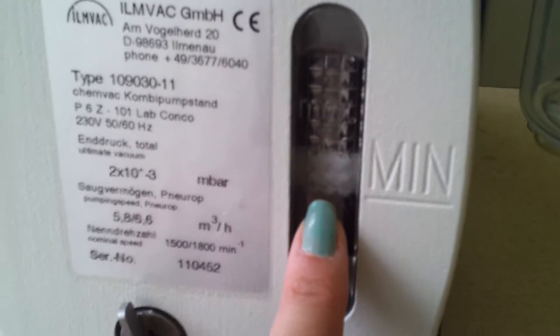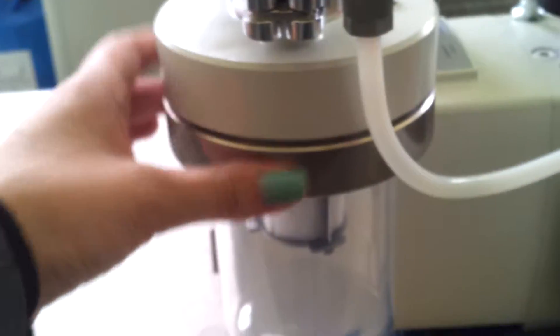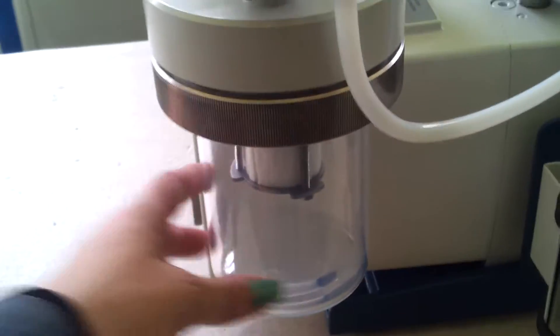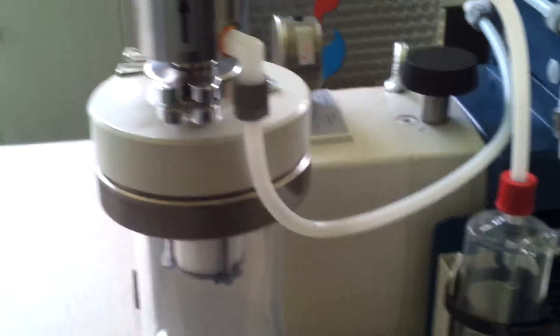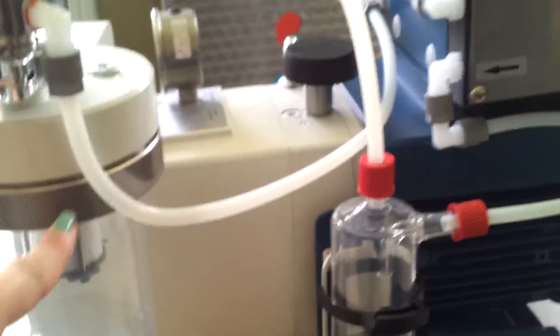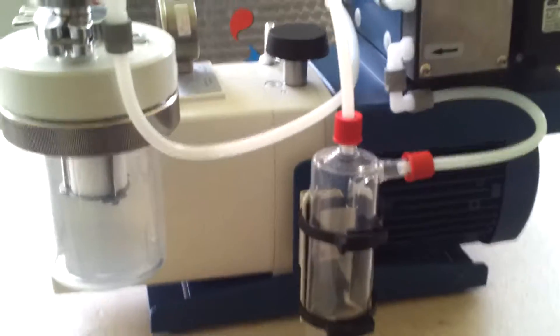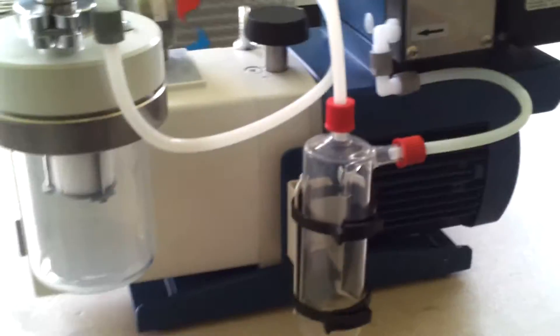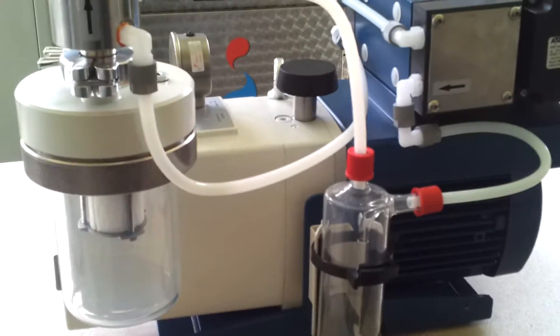We have a mist trap for oil mist. Each flow coming into the system goes through the rotary vane system and the diaphragm system. We use this when we have applications with solvents that might contaminate the oil, for a better and longer-lasting pump.